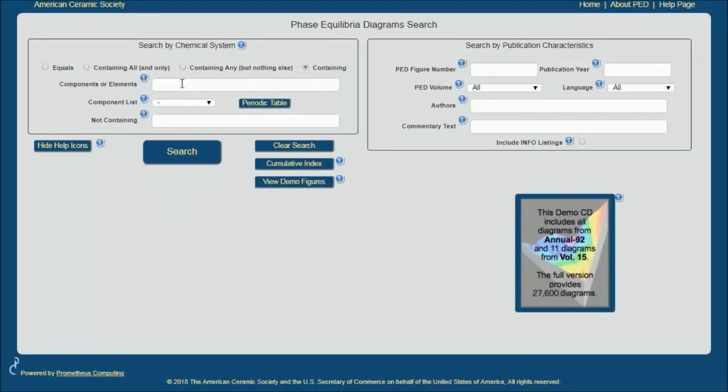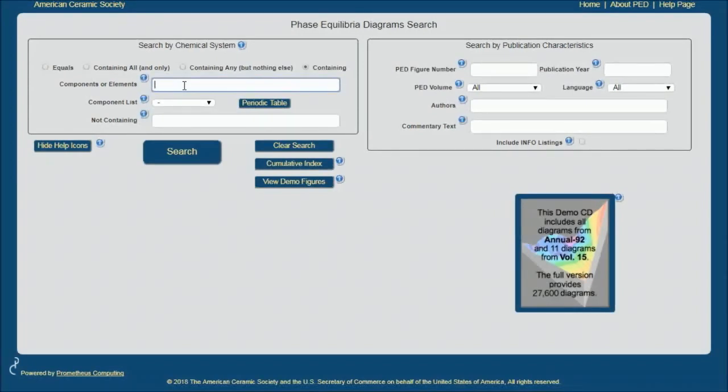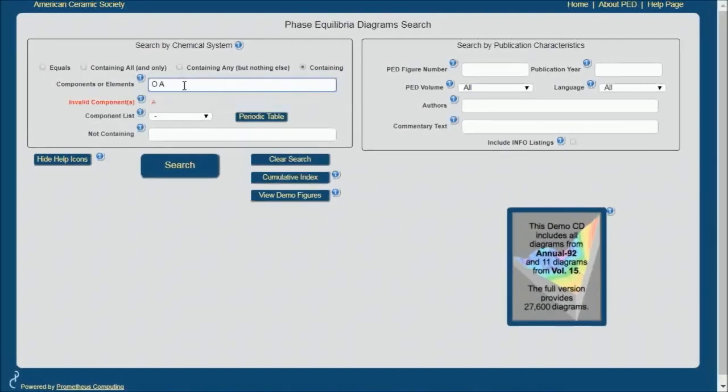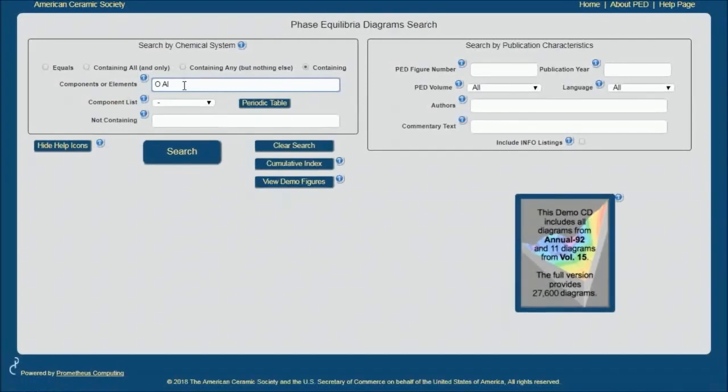The element or compound are entered onto this line that I just clicked into. You can enter your elements and compounds many different ways, by typing, as I'm showing you now.